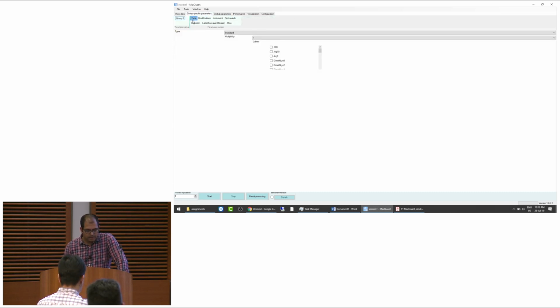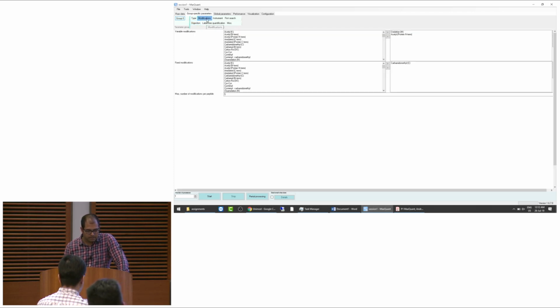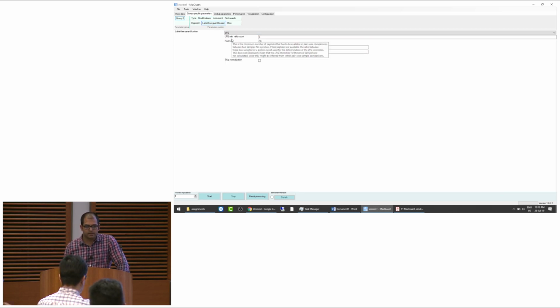Then in the type, this is standard and multiplicity is 1 because there is no labeling. And digestion, it's trypsin, same thing. Modifications, same. And then in the label-free quantification, we say LFQ. Right. So default value is 2, but I would like to use 1 so that it's reporting more LFQ values. It's like something like ratio count 1 in labeled samples.